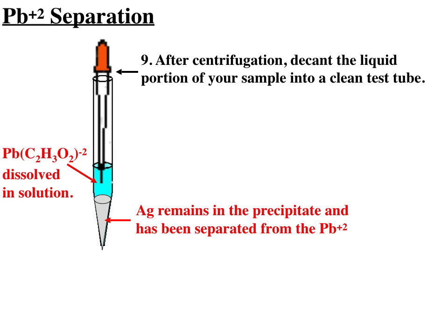We don't want to get the pipette down closely to the precipitate because it will end up sucking some of that precipitate up into the liquid, and that will contaminate and remix, if you like, the lead and the silver. We're working under the assumption here that the lead and silver have been completely separated. The silver is in the solid precipitate. The lead is in the complex form in the aqueous medium above. So by using my pipette, I'm going to be able to draw the liquid containing the lead apart from the solid silver.